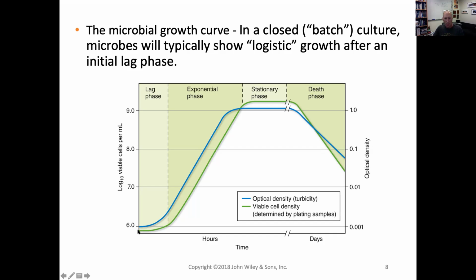I want you to actually plot your numbers directly, but set your y-axis to a log scale. Okay, I'll talk about that in lab, but I just want you to make that clear. At any rate, for purposes of this illustration, it doesn't matter what we have as a log scale here and a linear scale here.